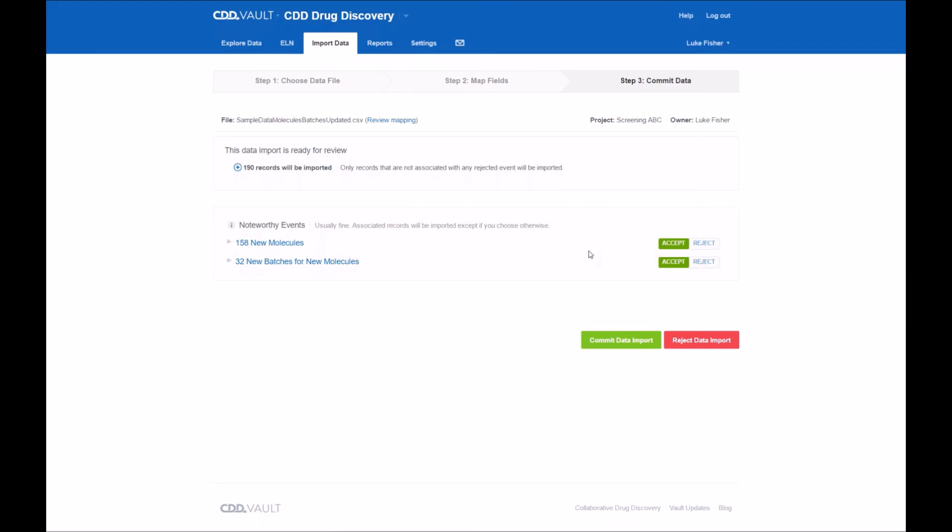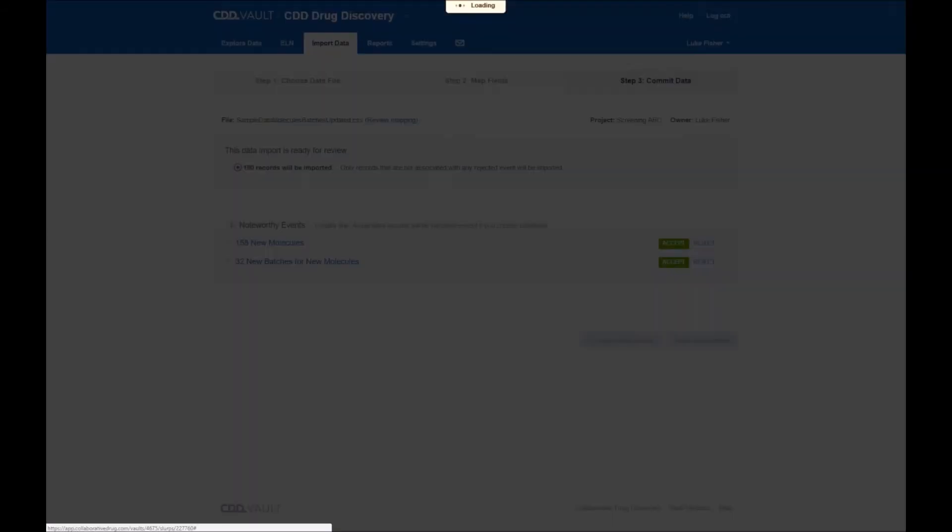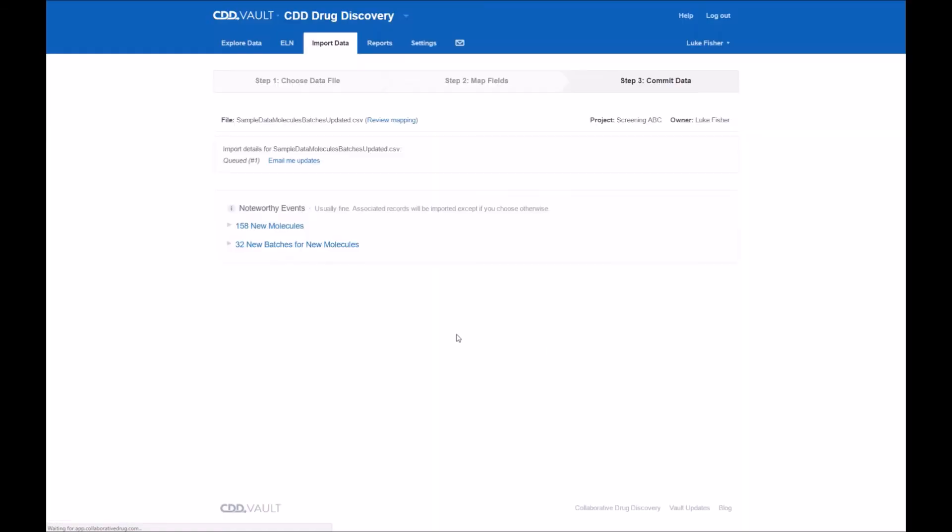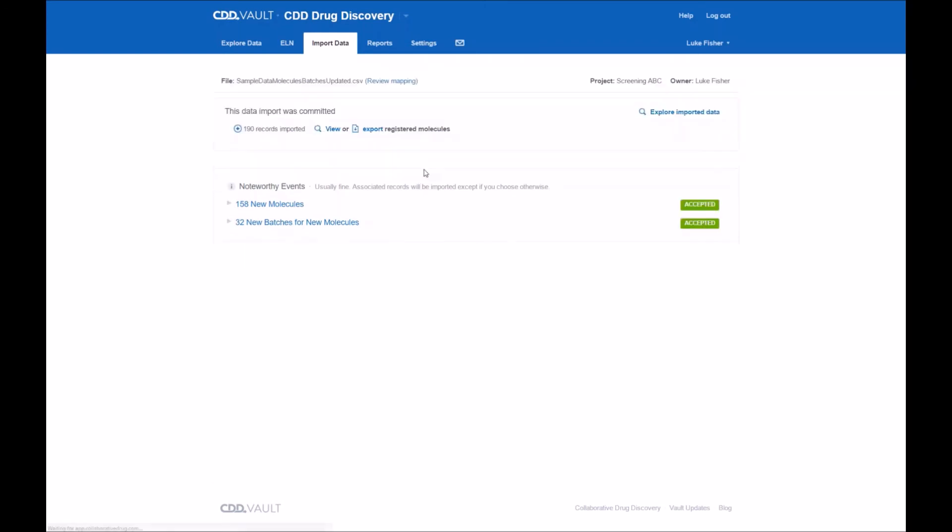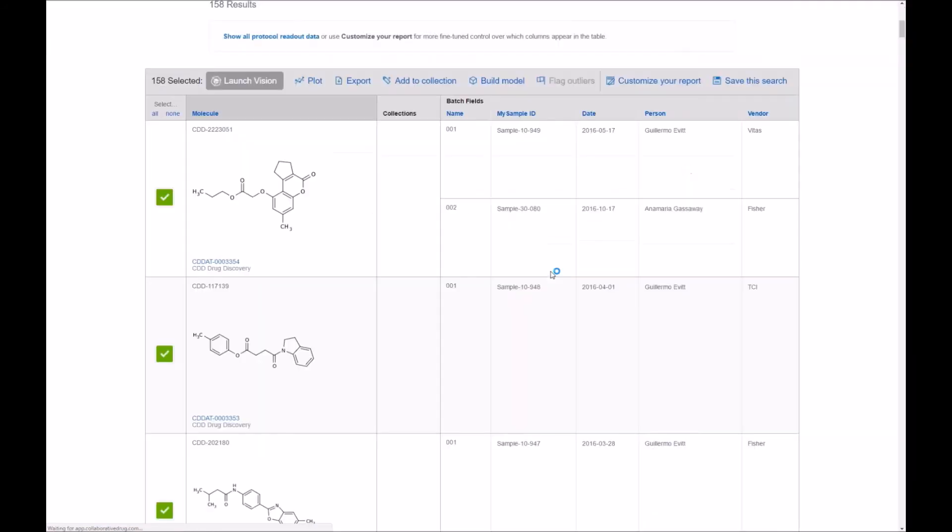Here we know that everything is mapping as we'd like and I can go ahead and commit the data import. Again after a few seconds the file will be going from the queued status to committing status and once that operation is complete you can view the imported data by clicking on the link explore imported data.